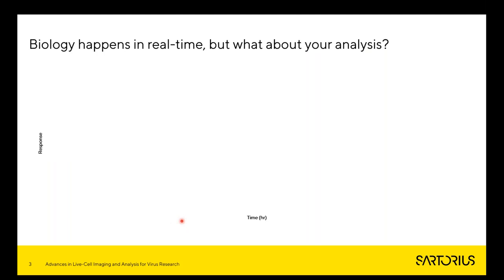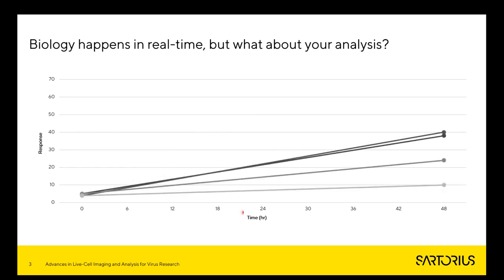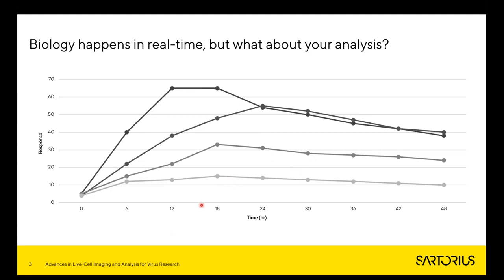Okay. So biology is something that happens in real time. However, traditional methodologies often rely on single endpoint measurements, and these single endpoint measurements often don't represent the true kinetics of the assay. With endpoint assays, you also miss out on these very important data points that happen in between. So therefore, going for more kinetic readouts basically allows you to then capture these very valuable data points that would otherwise be missed out on. And also, let's face it, no one wants to go to the lab at 2 a.m. to collect these very important data points.